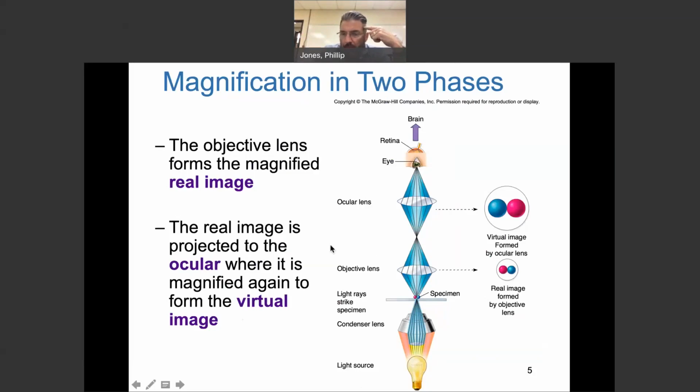So there's your objective lens, which you're switching back and forth, coming up through the ocular and then your eye. I said it goes through the cornea, aqueous humor, crystalline lens, vitreous humor, the retina, and then the optic chiasm. Remember, the medial fibers cross over, the lateral go straight through to the occipital lobe, and you register that in the brain as an image. But remember I said in lecture, the image is going to be inverted, could be upside down, depending on how you're imaging it.